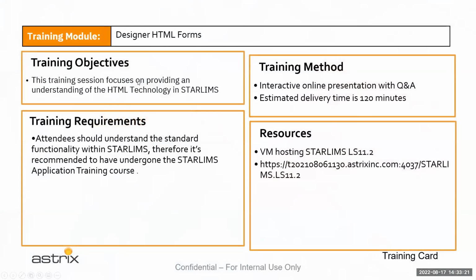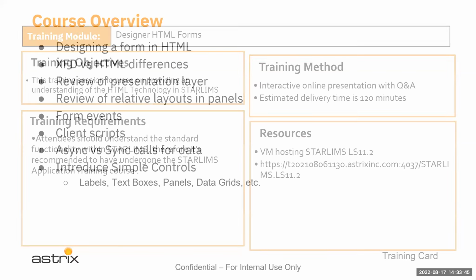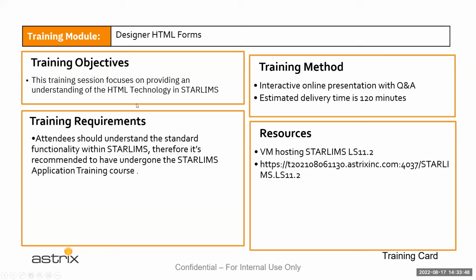All right, overall objectives. I mentioned a bit more of the objectives in my intro. It's 2 hours today and 2 hours Friday. It's not enough, so some self-training after these sessions will be needed, with questions and playing around in the designer. We cannot break anything, and if we do, we can restore it, so don't be afraid to go in. Just be careful not to delete something that's already there. But if you create something new, you can delete it and move things around. Hopefully we'll have time to go into some of those things. The best way to learn is to actually practice it.